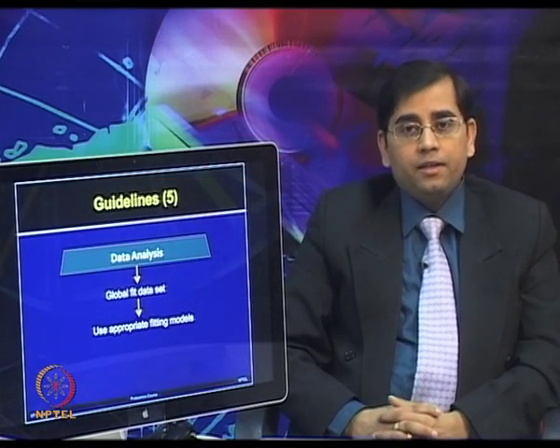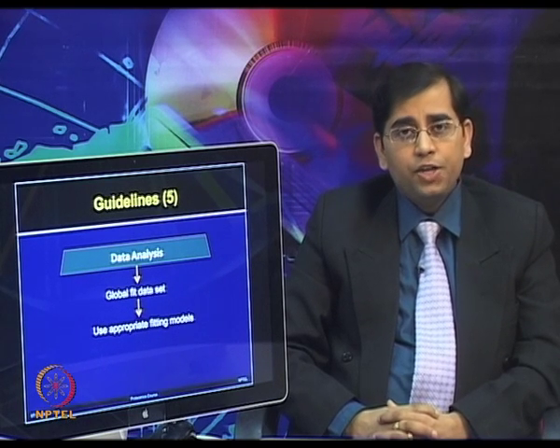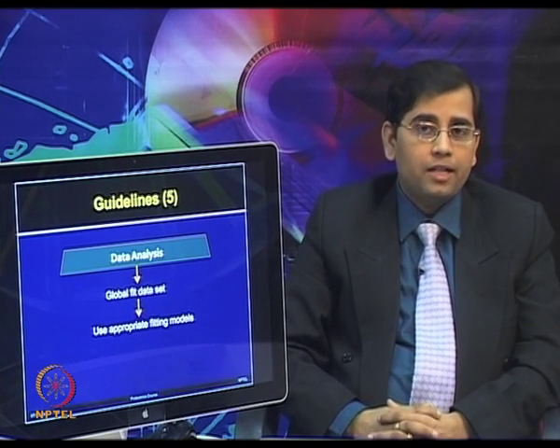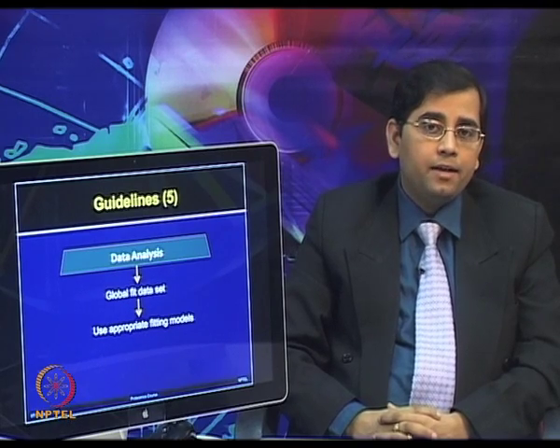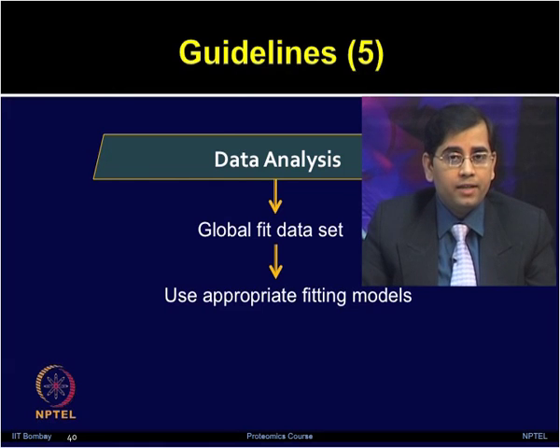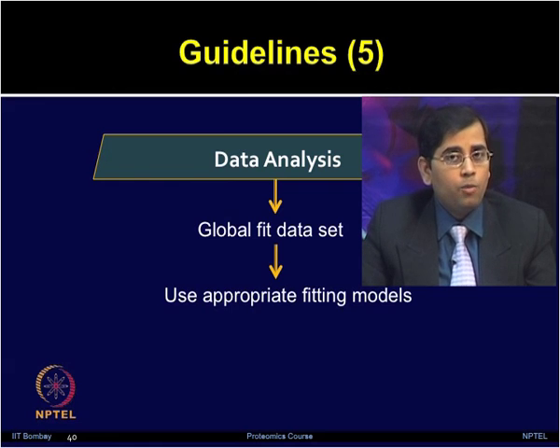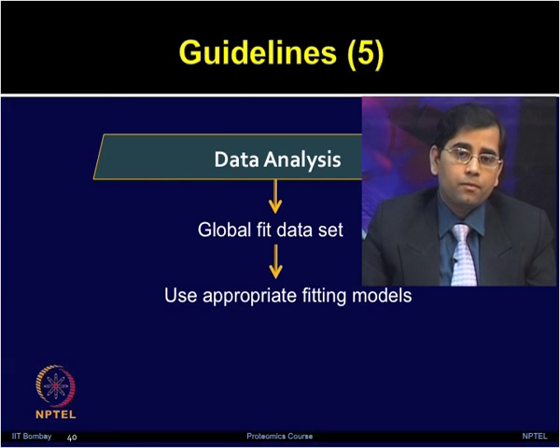Now, how to fit the data? The global fitting models or selection of appropriate fitting models are always very critical. One issue which people often encounter is the avidity issue. So, the experiment must be designed accurately. If binding data has to be correlated with an interaction model, one needs to avoid the avidity issues.